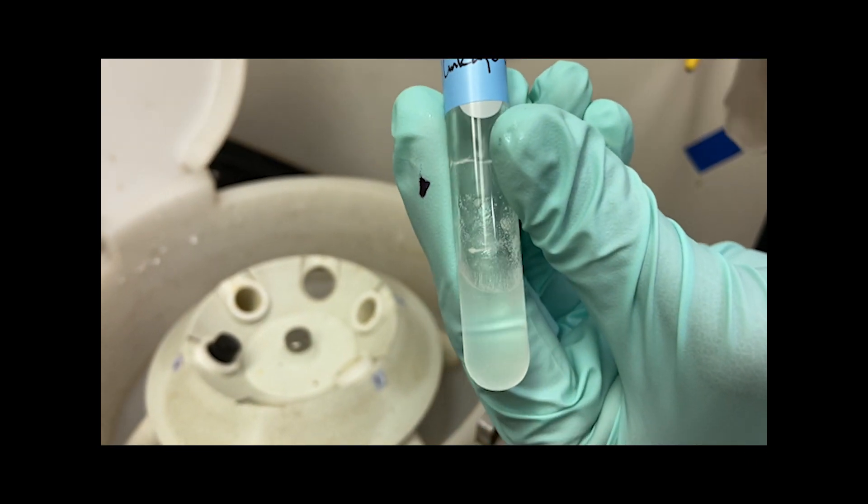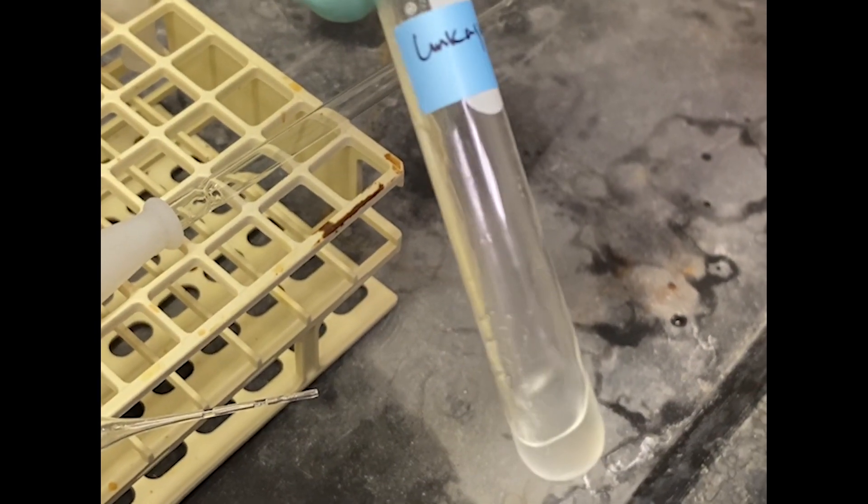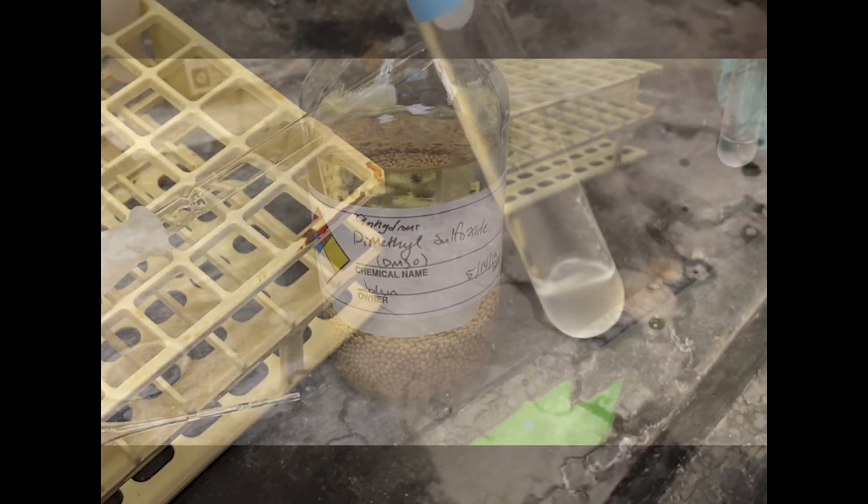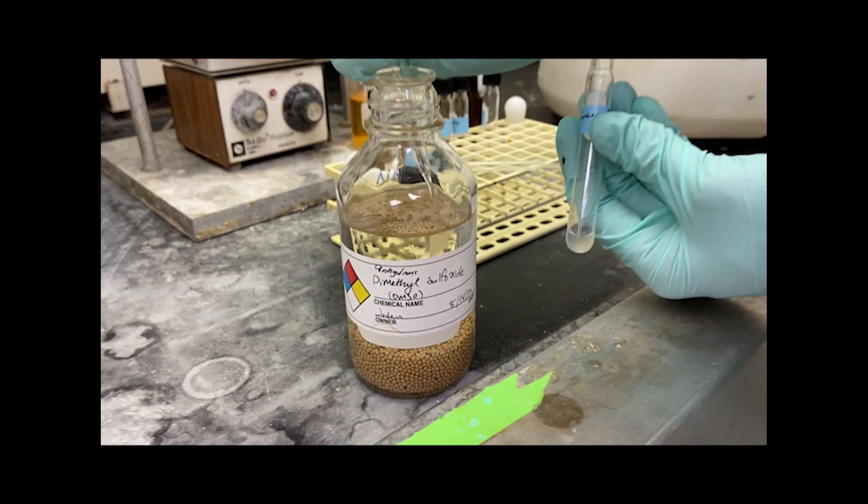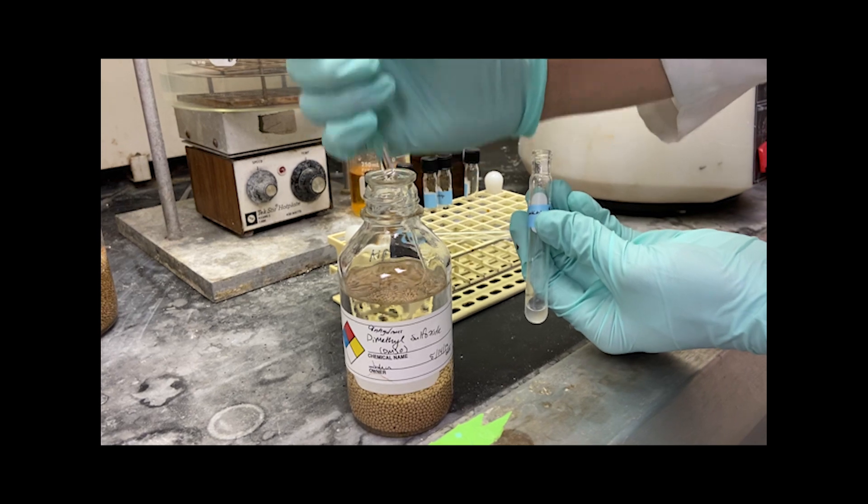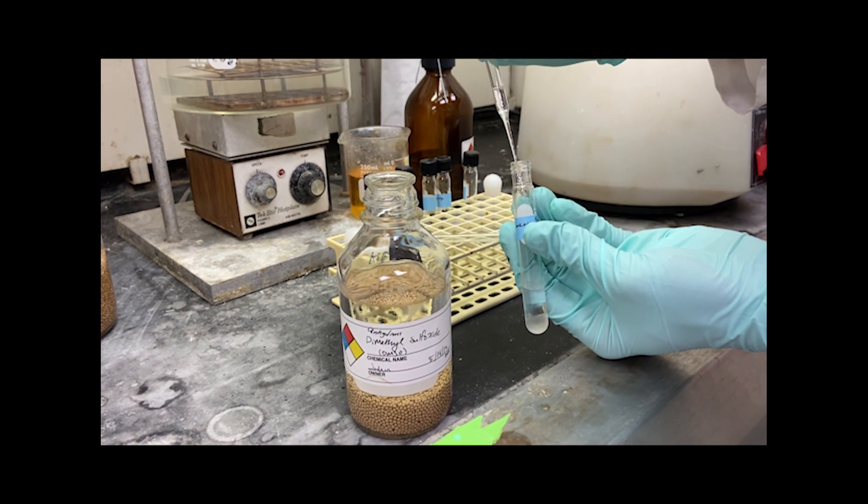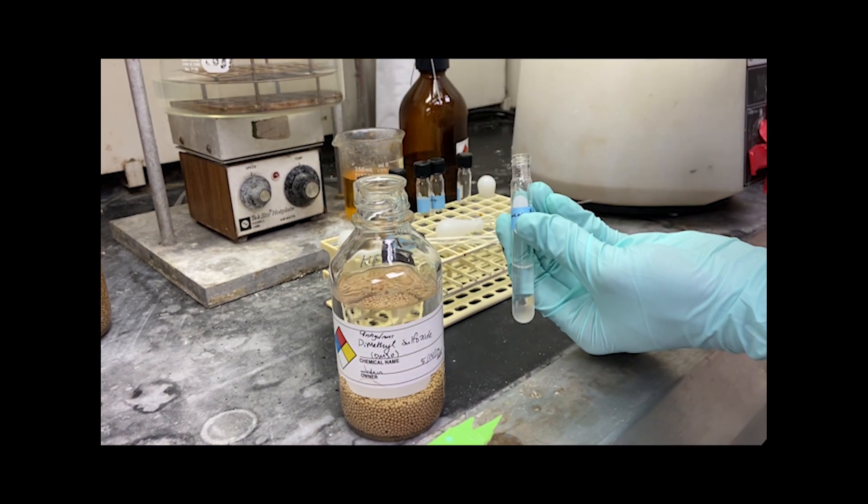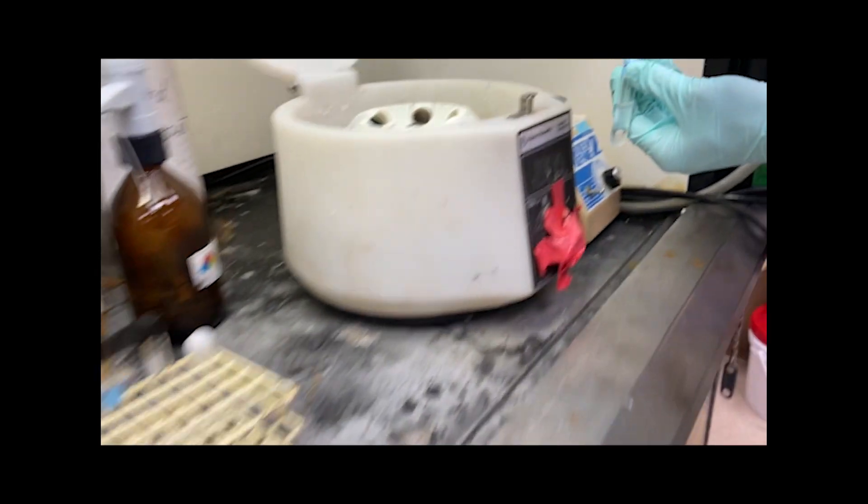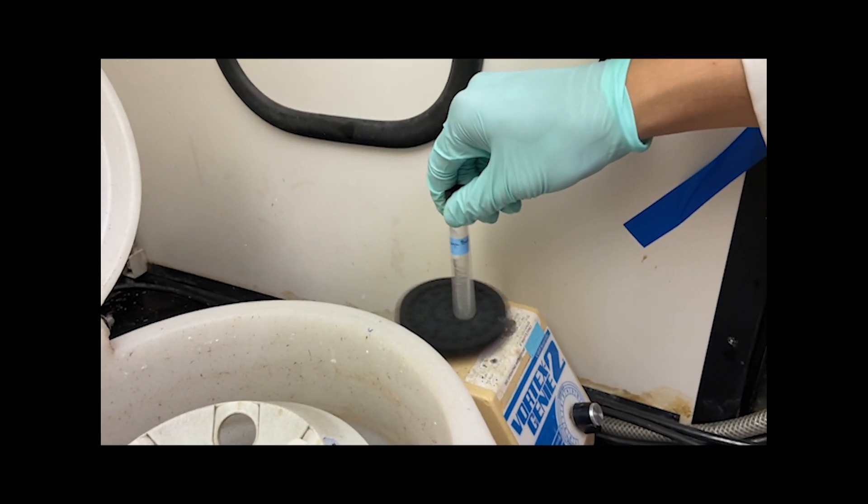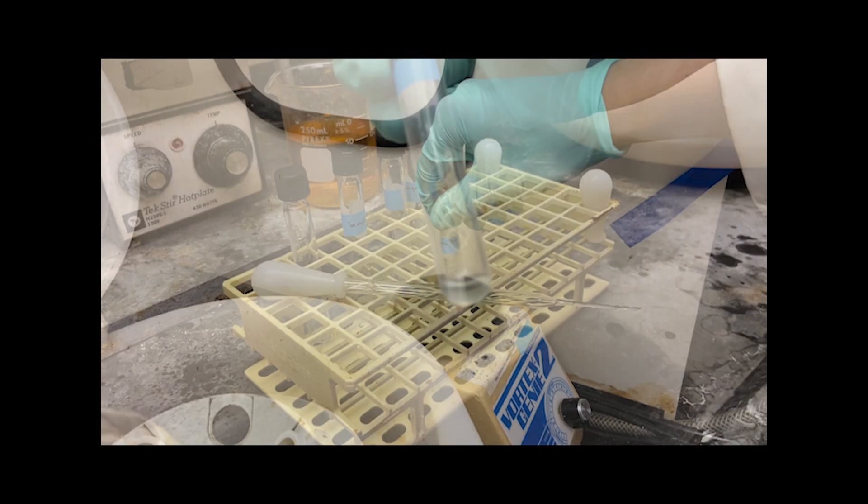We then pipette out the top DMSO layer and rinse the walls of the tube and discard that top layer. We then repeat that process by adding 2 more milliliters of DMSO, vortexing, centrifuging, and removing that DMSO layer while washing the walls of the tube. We do this until the DMSO layer removed is clear.